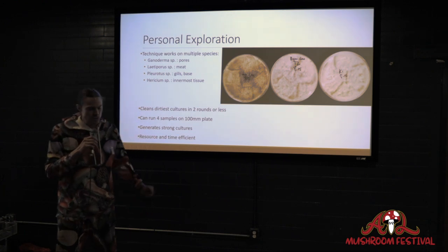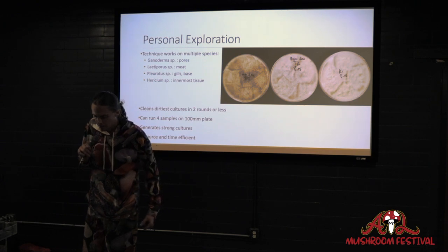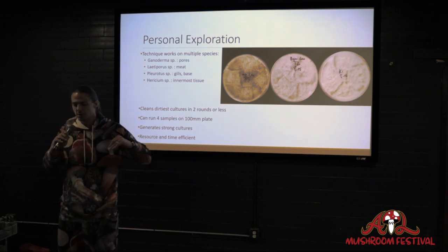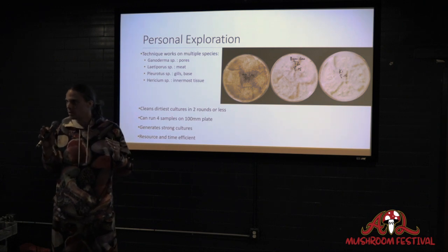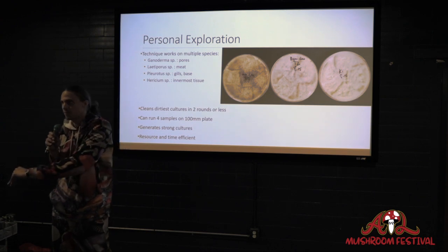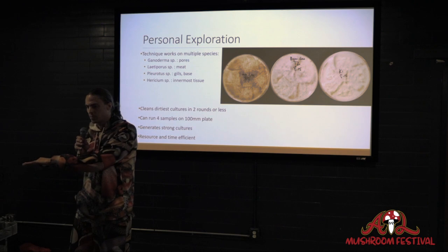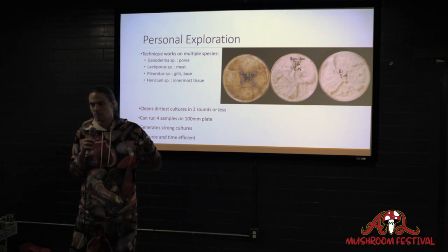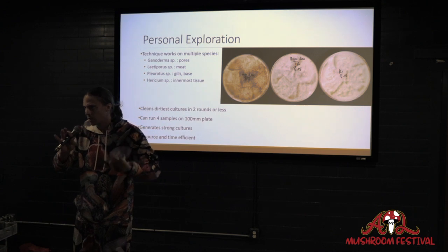But at least for reishi mushroom, I've found that being able to get multiple layers of progeny and then using the technique in order to filter out what the good stuff is versus the not good stuff definitely helps me to get a good lineup of monoclonal cultures that I can then run together to find what's really going to be the slam dunk.